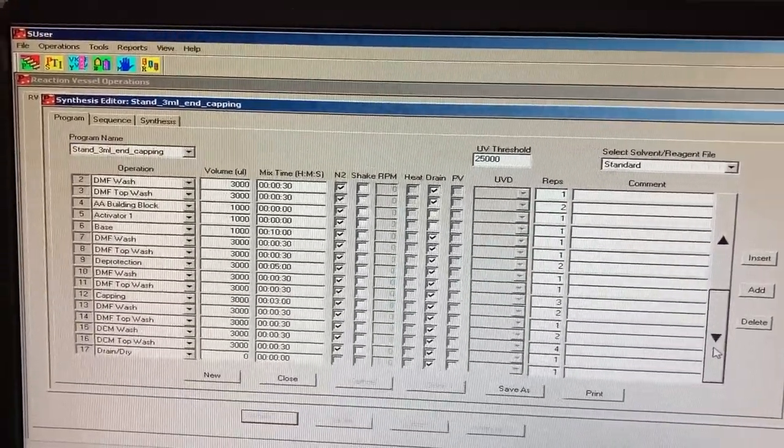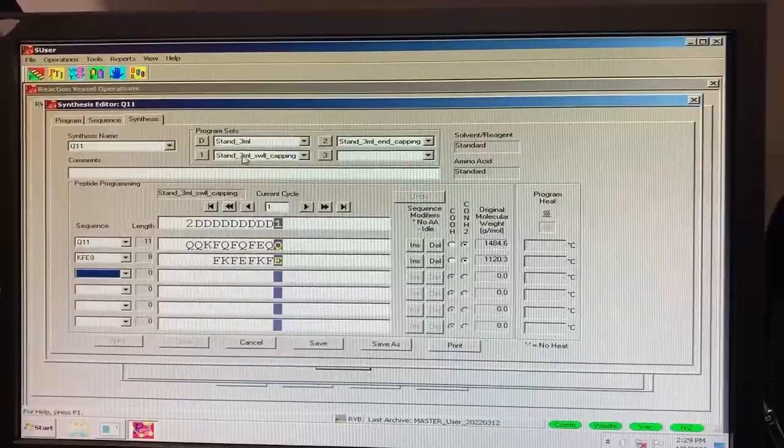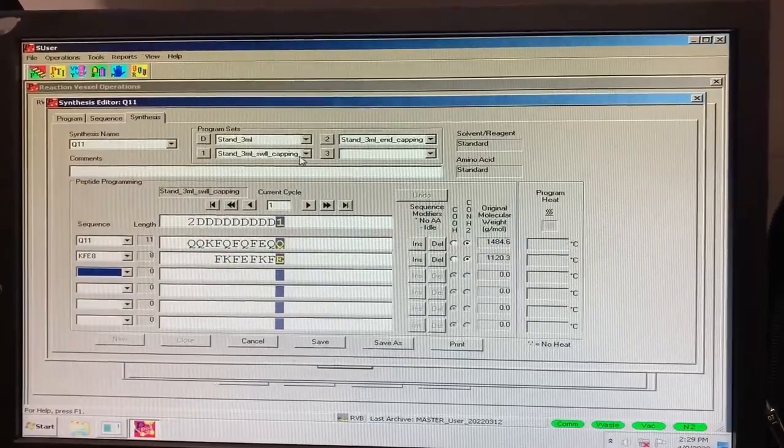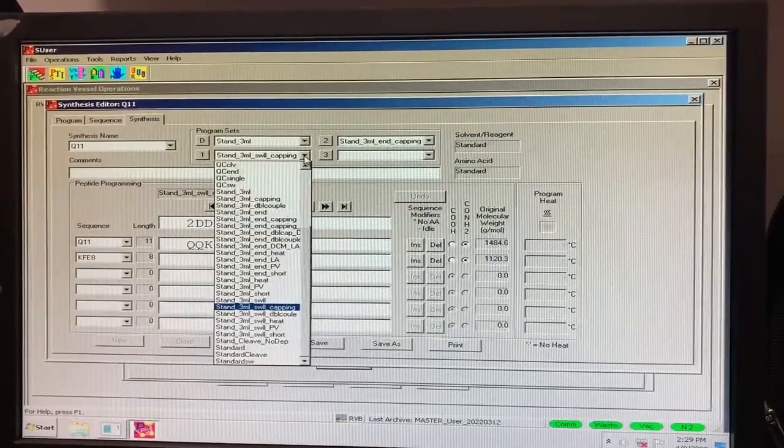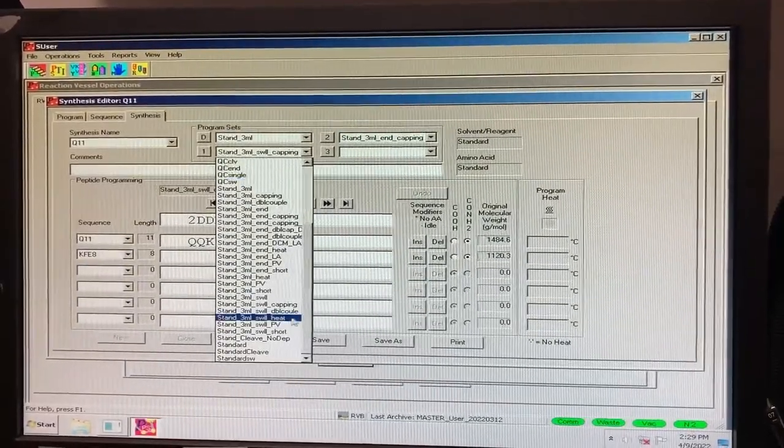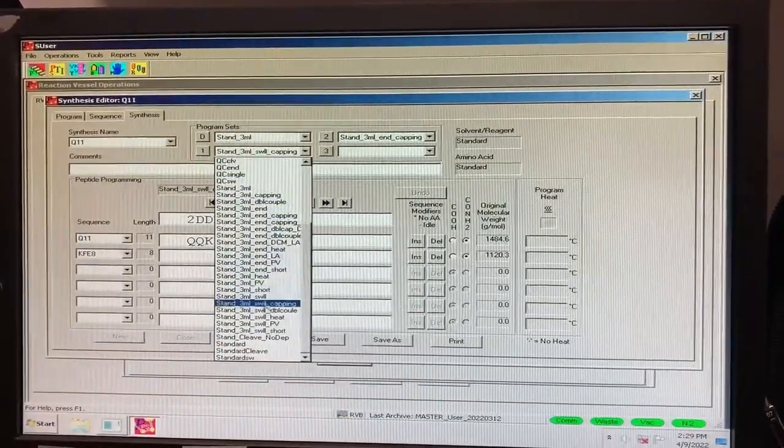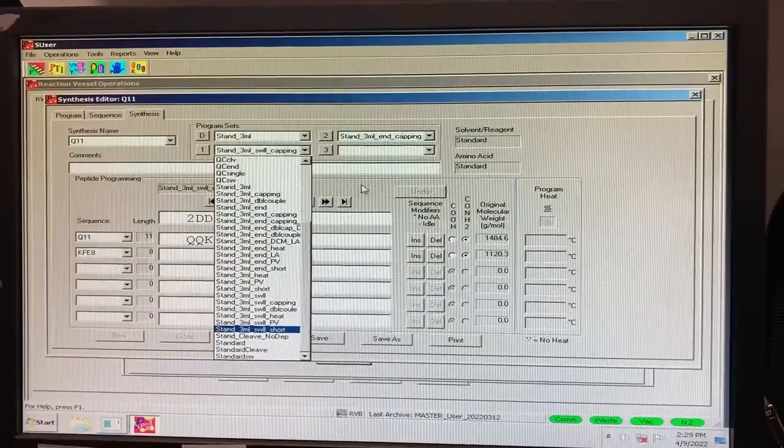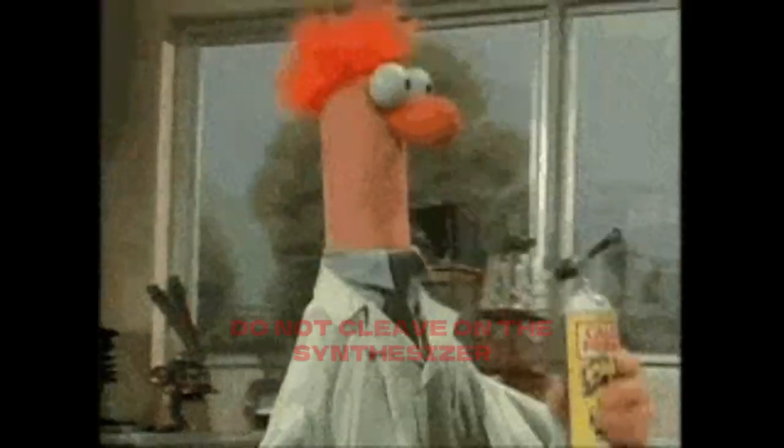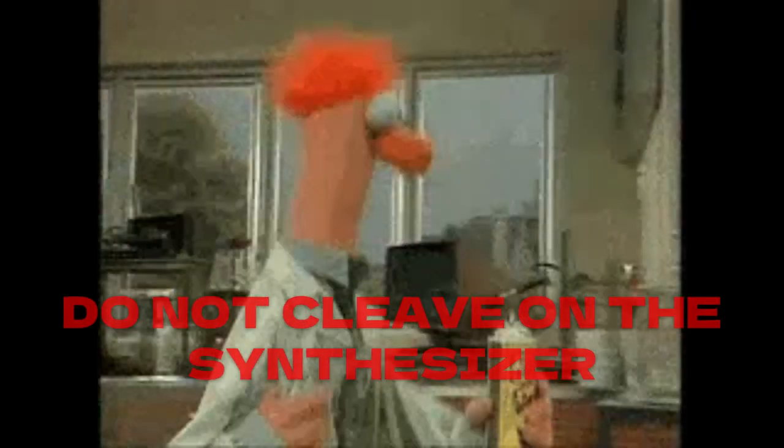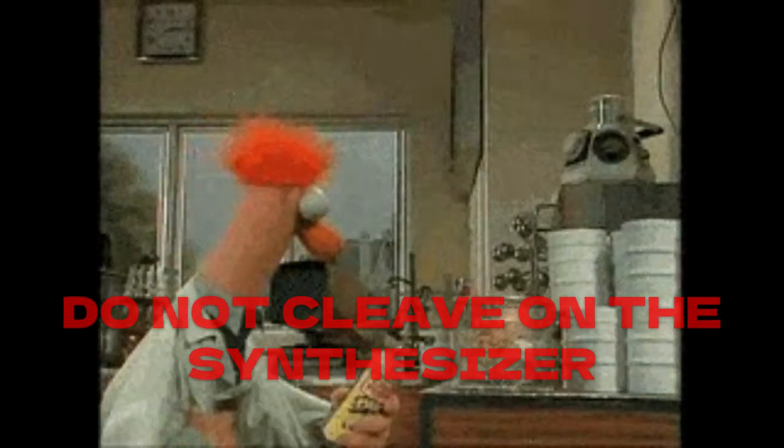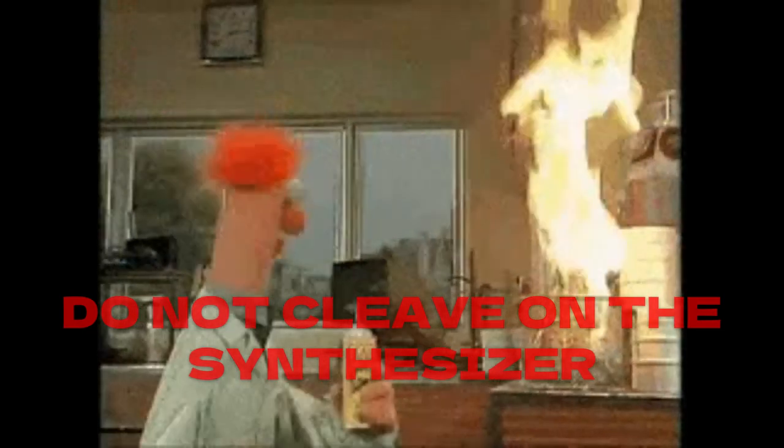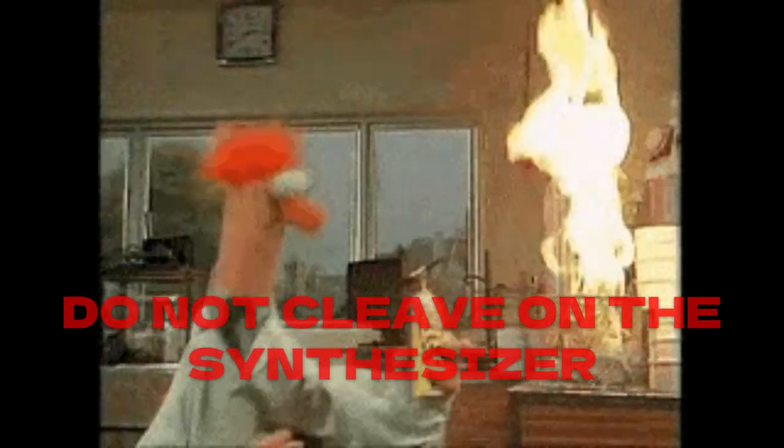If you want to change any of the programs, simply select the dropdown arrow and pick the program you want to use. Note that we do not perform cleaving steps on the synthesizer. When your synthesis is complete, you will need to transfer your peptide to a new reaction vessel and cleave your peptide by hand.